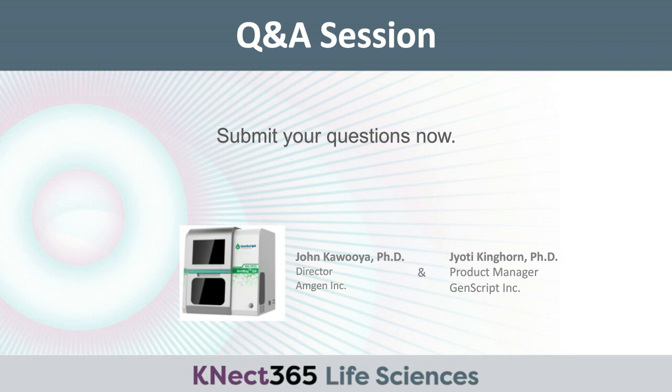Yeah, I could chime in here because I've been addressing this question. One of the big challenges with the magnetic bead has been trying to reduce the elution volume. The tendency is that because you're doing it batch-wise, you tend to repeat a number of elutions and so on. So I've developed some elution buffers which can allow you to elute these proteins in extremely high concentration and very low volume. One elution step and all the protein comes off the beads. So the bead volume ratio is no longer a big factor now.